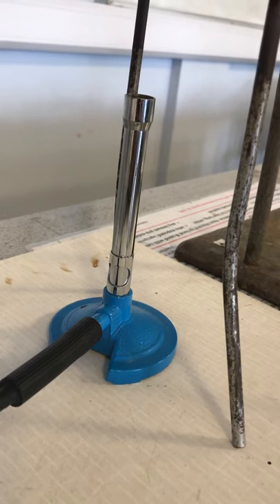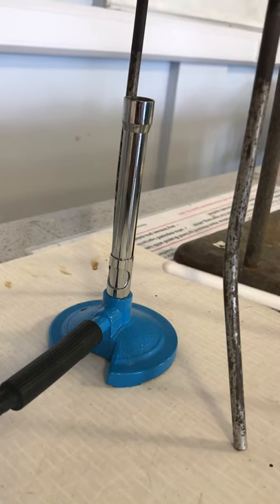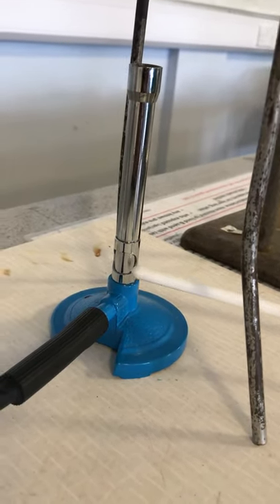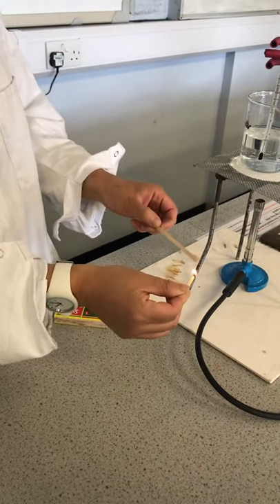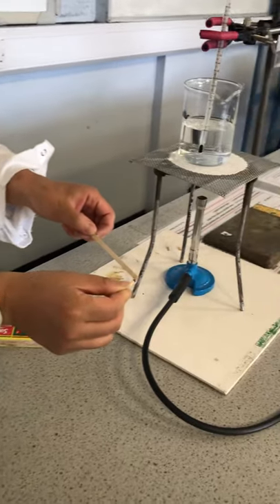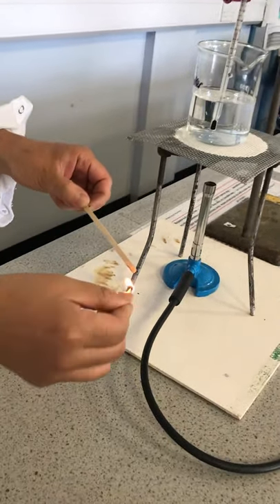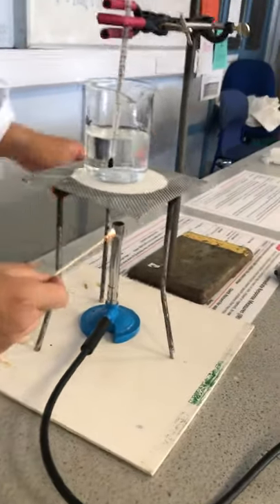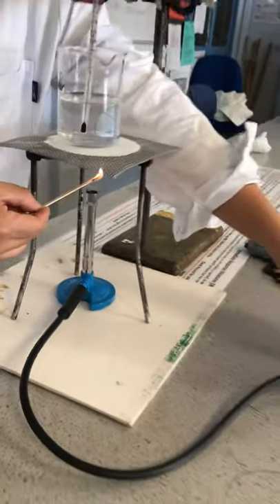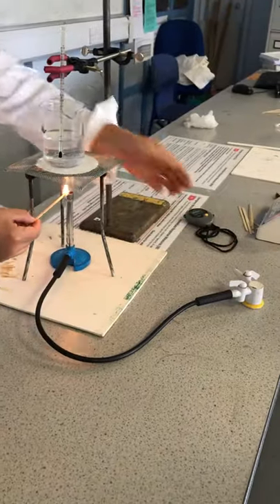Before you light the Bunsen burner, make sure the air hole is completely closed. With the lit wooden splint, light the Bunsen burner by placing the wooden splint over the nozzle of the Bunsen burner and at the same time turn the gas tap on.